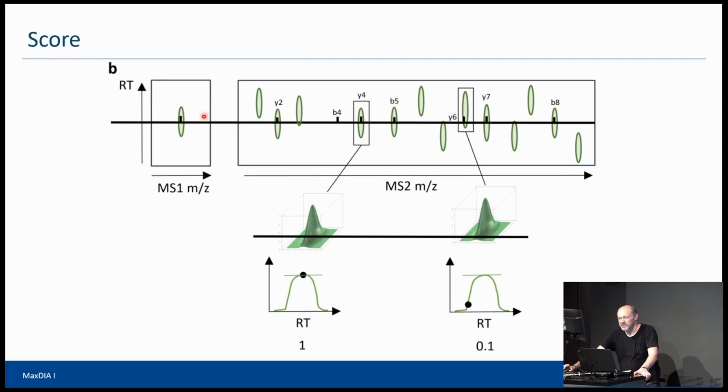So that's in the precursor data. Then we look into the fragment data for the particular mass window where the library spectrum fits, basically. You have to go to the correct plane for this particular mass window, and we look into this data as well for matches between the library spectrum peaks and the peaks in this particular MSMS data plane. Here we would, for example, see that for the y2 of the library spectrum, we do indeed find some feature, which again could be with or without isotope pattern. Both are looked for.